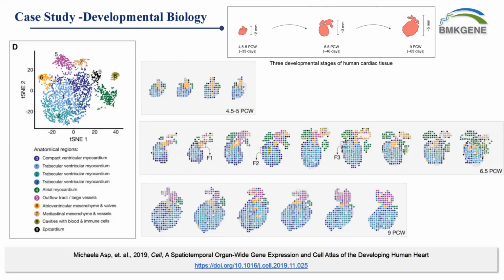And also, if we look at the outflow tracts, you can see a more condensed signal identified in this 9 weeks one. So if you're interested in this paper, I also provided the DOI here, where you can see there is more data or more results interpretation that they mentioned in this paper.